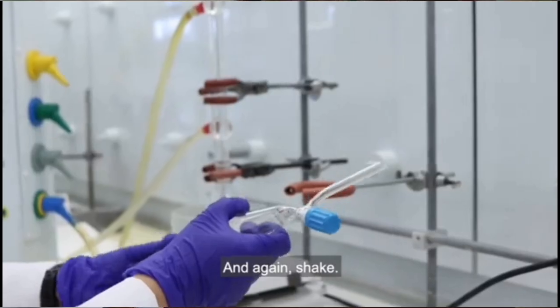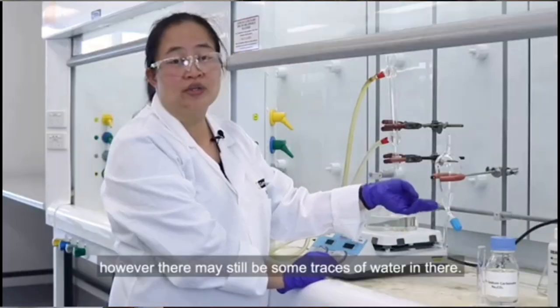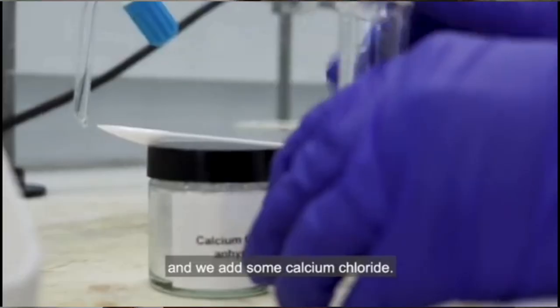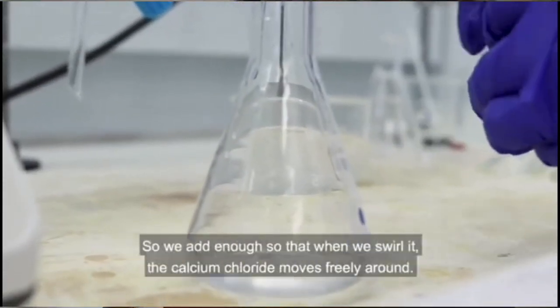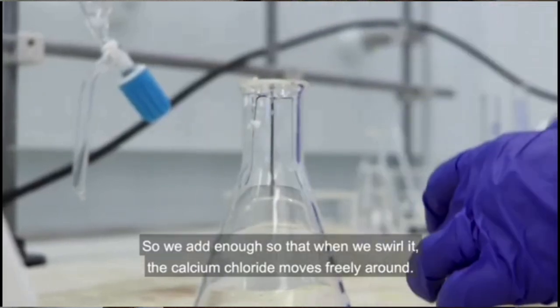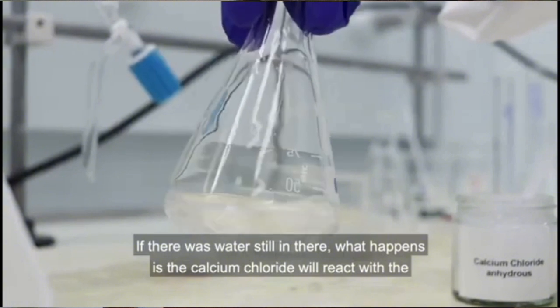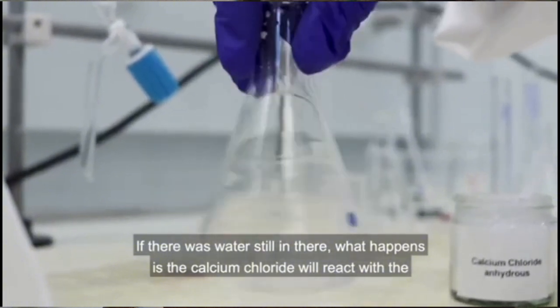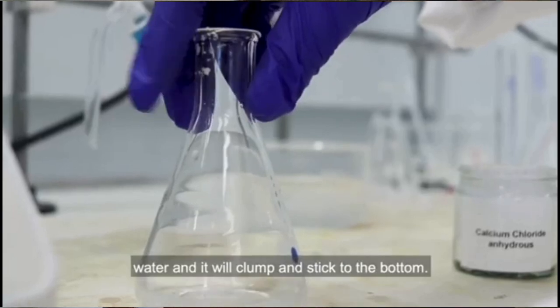And again, shake. However, there may still be some traces of water in there, so we add calcium chloride. The amount we add depends on how much water we have. We add enough so that when we swirl it, the calcium chloride moves freely around. If there was water still in there, the calcium chloride will react with the water and it'll clump and stick to the bottom.